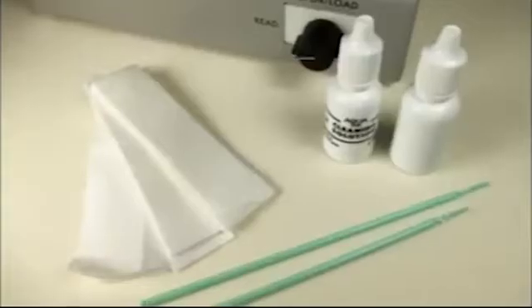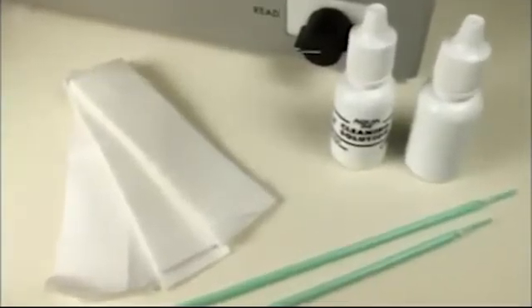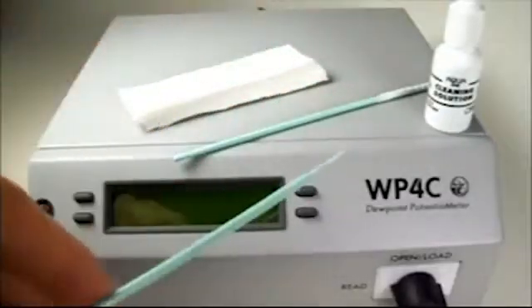To clean, all you need are kim wipes, isopropyl alcohol or Decagon's cleaning solution, distilled water, and tiny spatulas like this one.